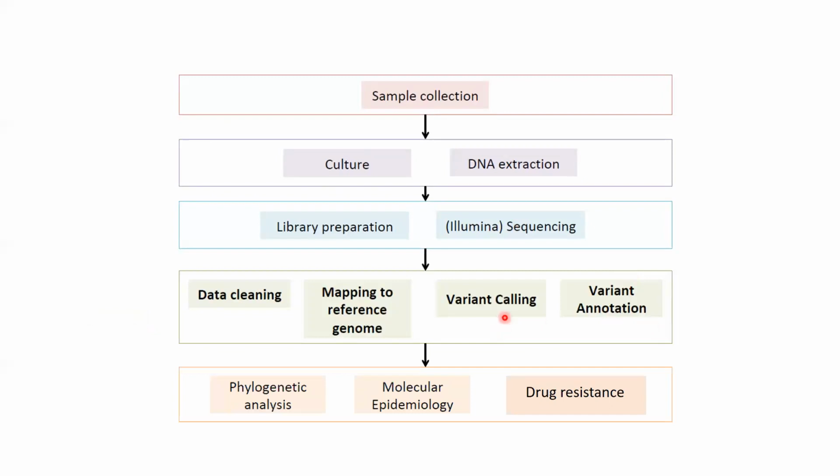Once we have our variants, we proceed to downstream analysis such as drug resistance, molecular epidemiology, or phylogenetic analysis. In reality, these are the analyses that allow us to answer our research questions. They will be covered on day 3 of this workshop by Galo Goich and Christopher Stritt in a few webinars and hands-on tutorials.